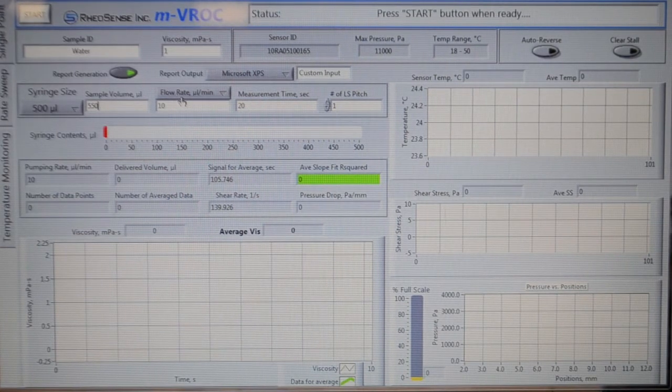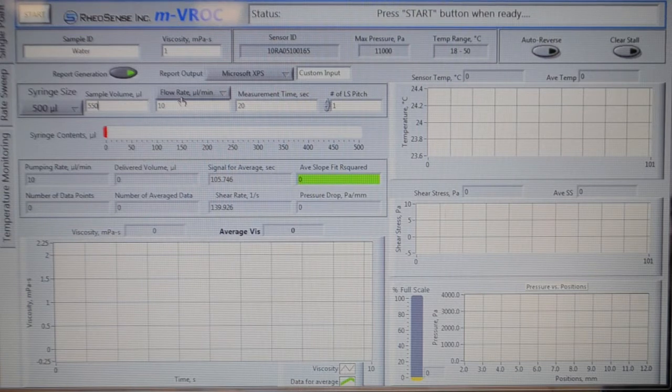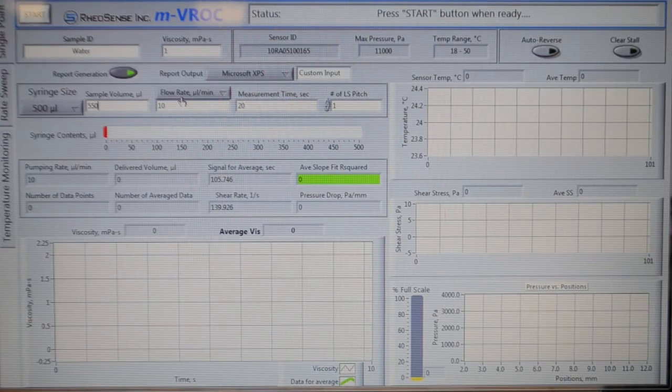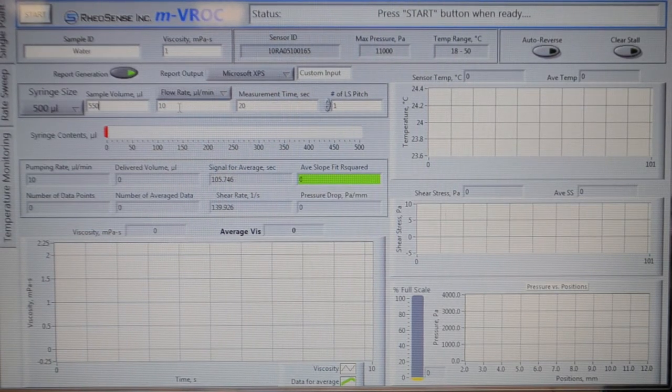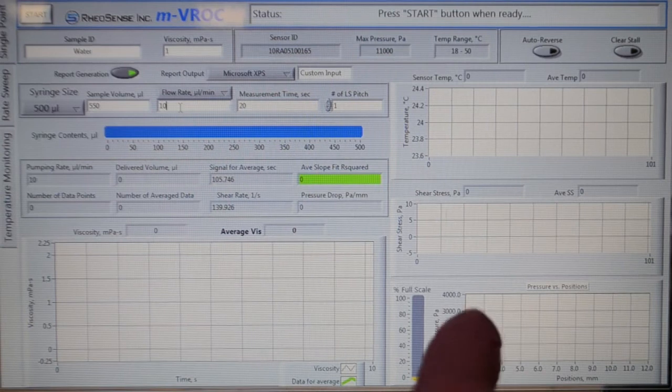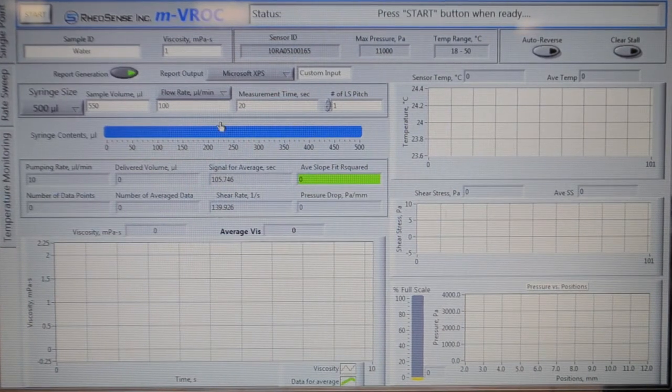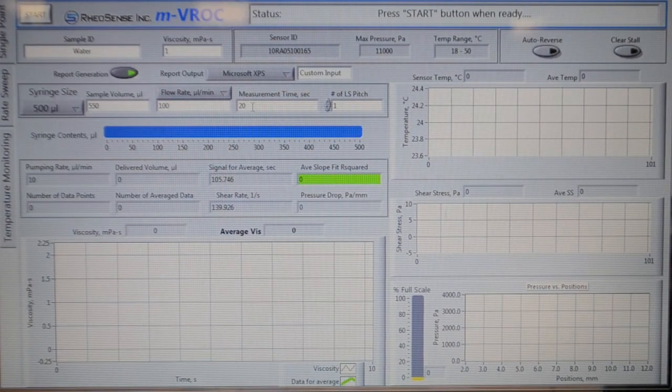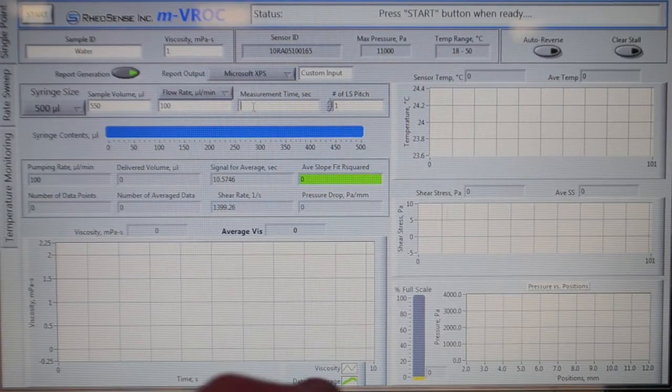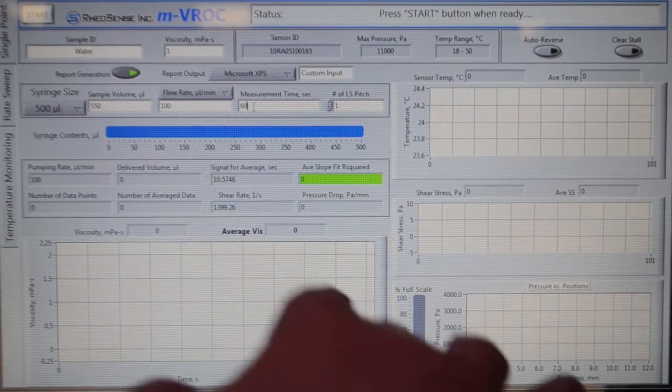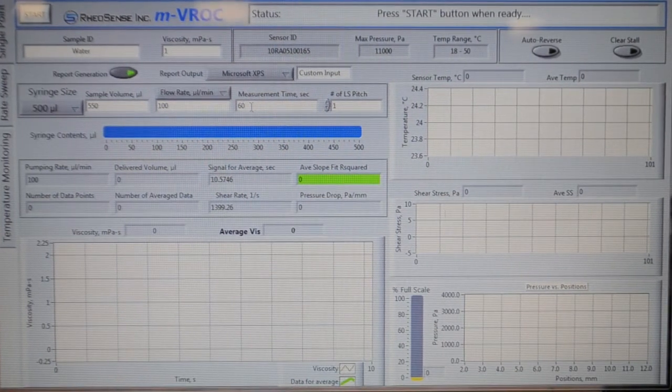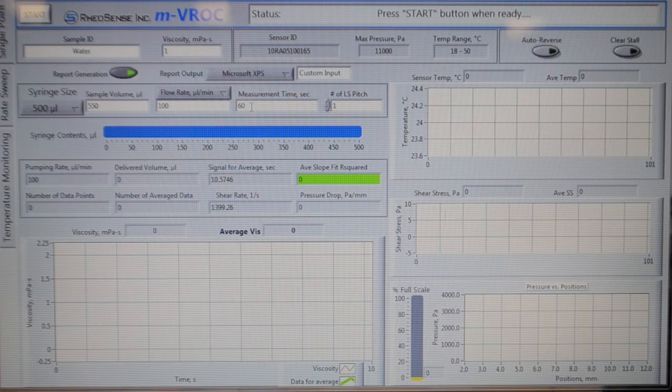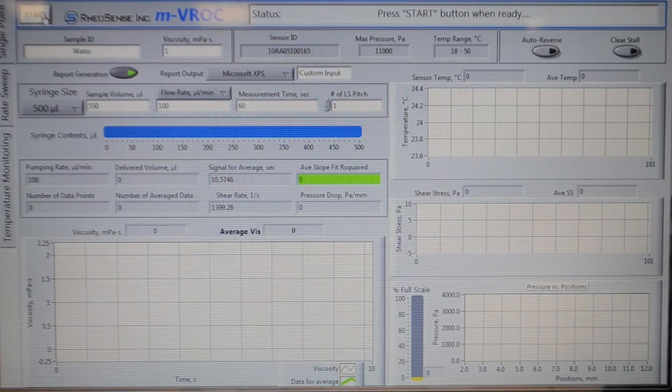Then we need to set the flow rate to 100 microliter per minute and the measurement time to 60 seconds. Then we can go ahead and click start.